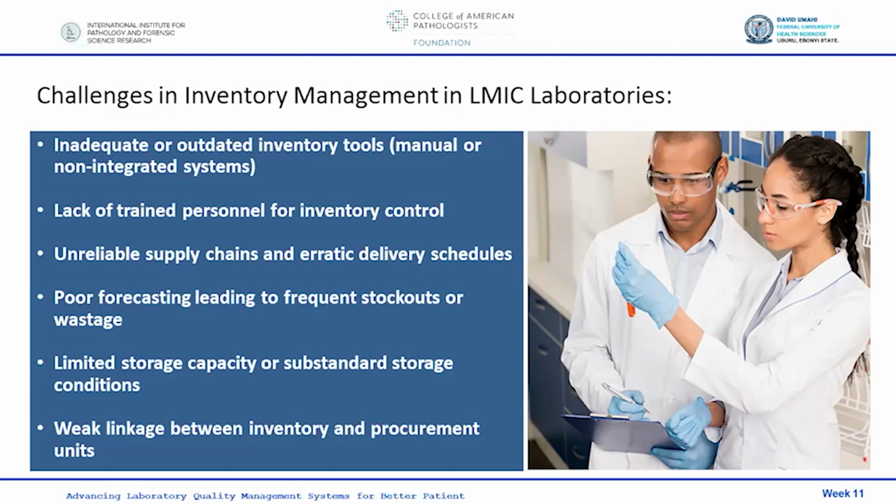Lack of trained personnel for inventory control, unreliable supply chains and erratic delivery schedules, poor forecasting, because it is difficult to forecast efficiently when you are using the traditional paper-based method of inventory, because you're not seeing everything in real time.